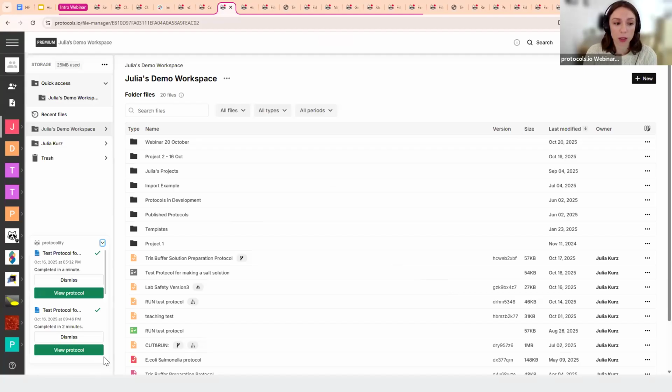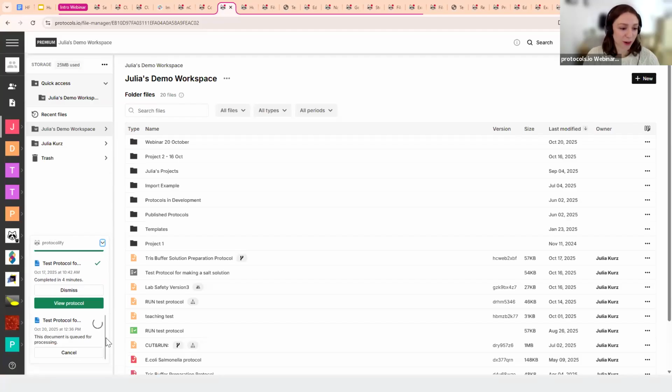So you should see something here, and shortly it will start processing that protocol. It usually takes a few minutes. It depends on the complexity of that protocol. But it will bring that in. So I do various webinars. This is the one that's processing at the moment. These are previous ones that I've brought in. But while that's processing, what I will do is show you how to create a protocol from scratch.